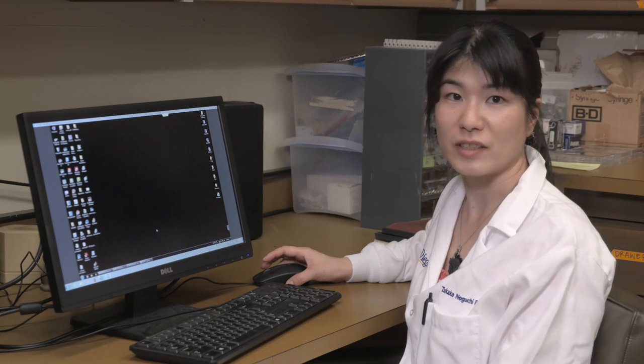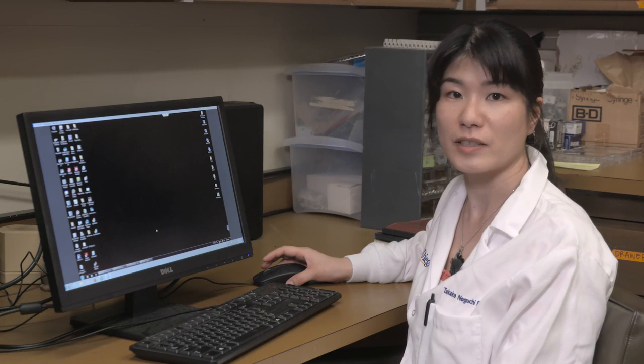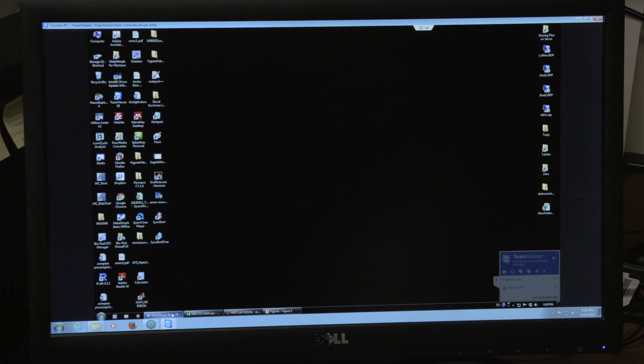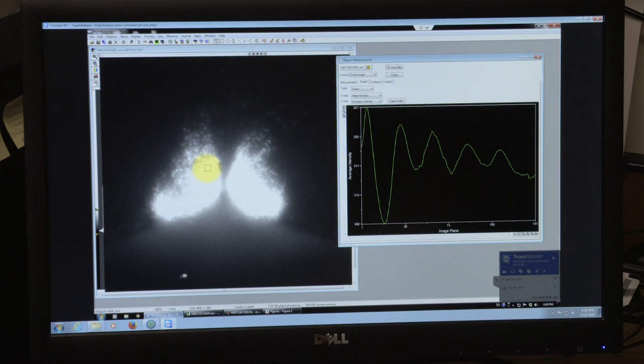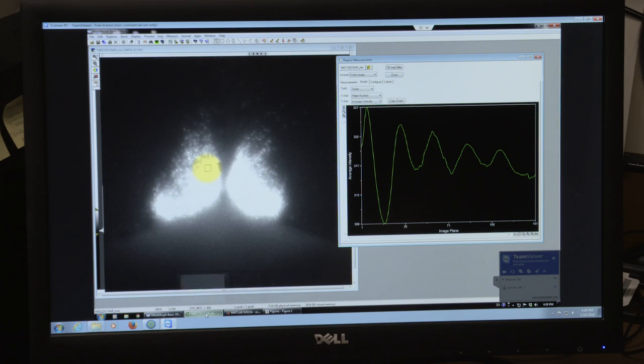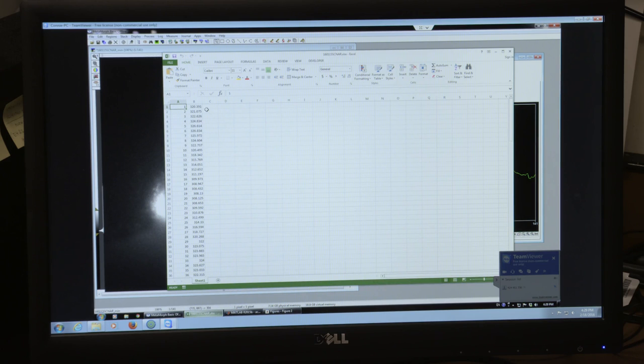Bioluminescence intensity of single neurons is analyzed using Metamorph. We select a region of interest in the stack file. The values within the region are exported to Excel for bioluminescence intensity analysis of single neurons.